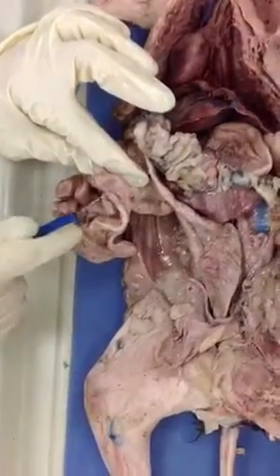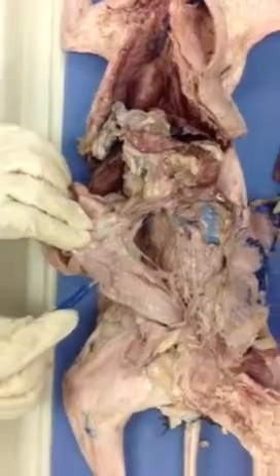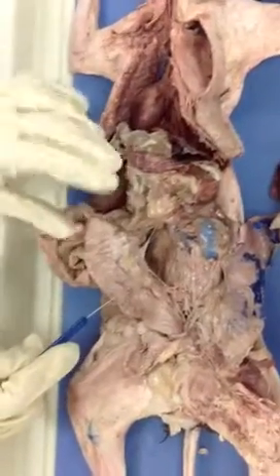Now I continue my journey, and then I encountered this. And what about this pouch? What's this called? Cecum. The cecum. Very good. Now, here in the large intestine, I encounter another mesentery. What's it called, please? Mesocolon.